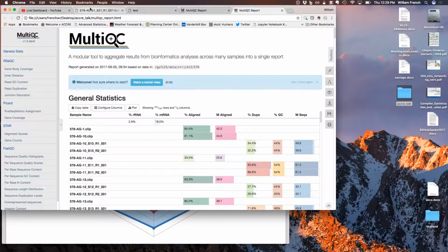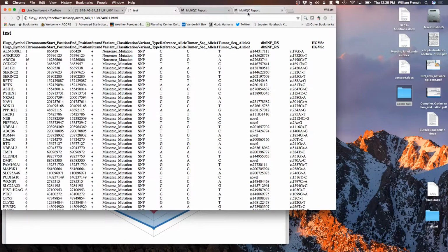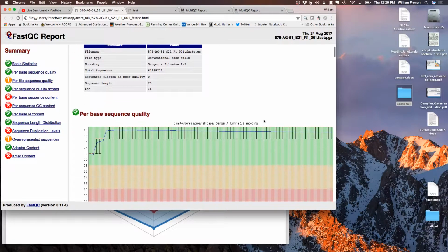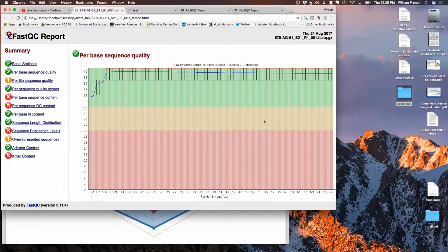This is an output of a FastQC for a single sample. There's a bunch of metrics here. First thing we get is the binned quality score by base for sequencing. So this is 75 base pairs, and the quality score is very high across the whole length of the read on average. Old sequencers, you often see a decrease over time due to phasing. As the enzymes have gotten better and better with Illumina, you see less and less of that now. But that's also why we'll sometimes trim off the back end.